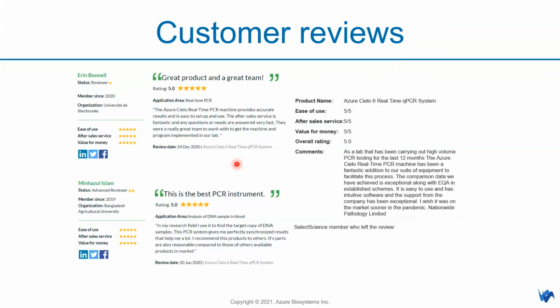Therefore, the optical design is very important here. It tells you what you can get. If your experiment is fine, with good expression, that is fine. But if you encounter a very lowly expressed gene and you cannot increase the RNA load anymore, then I think you might have the option to try a different kind of qPCR platform to see whether it gives you the data that you want.